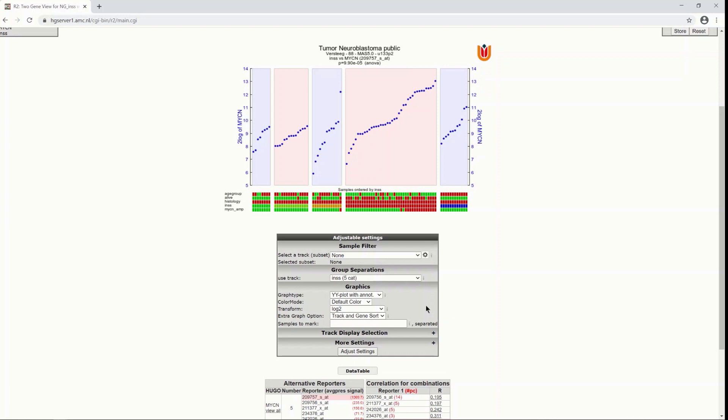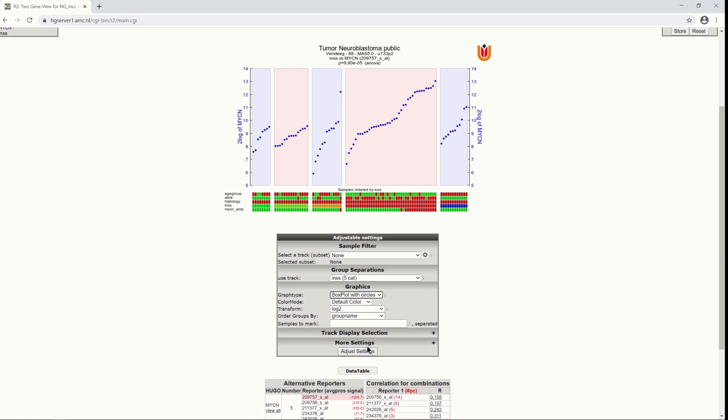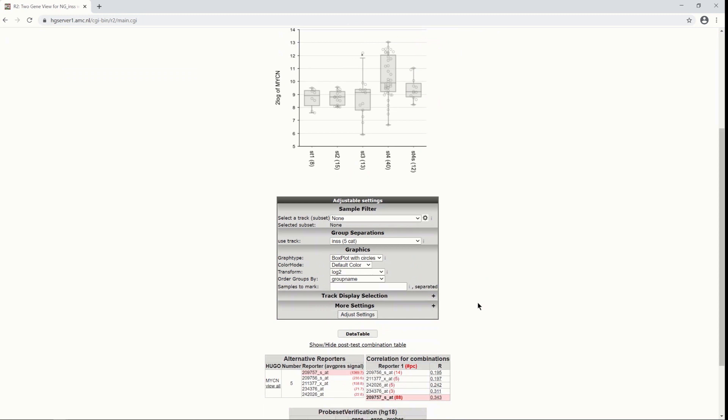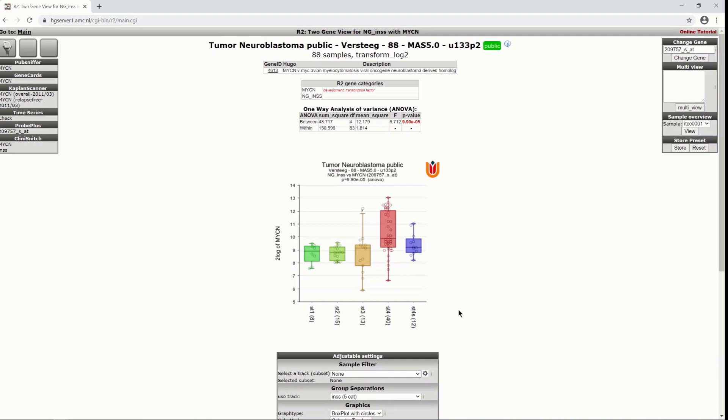From here also you could choose to choose a bar plot for representation or one plot that I actually like quite a lot is the box plot with circles and that gives you a nice clear view both of the samples that are in the group and the statistics that go with their expression values and you can also in this module color by track adjust settings and you have a quite neat overview.